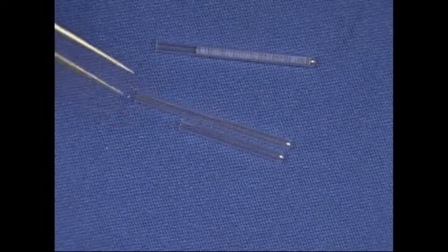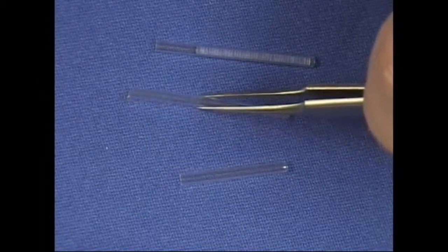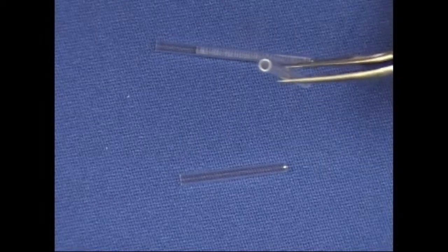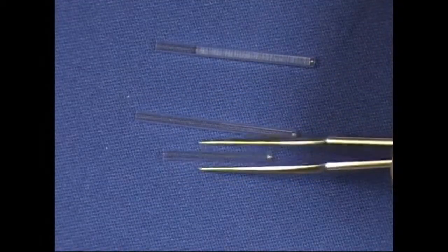Now on the pyroprobe autosampler, when the sample is loaded into the autosampler, it actually sits vertically, whereas the quartz tube in the manual pyroprobe sits horizontally.